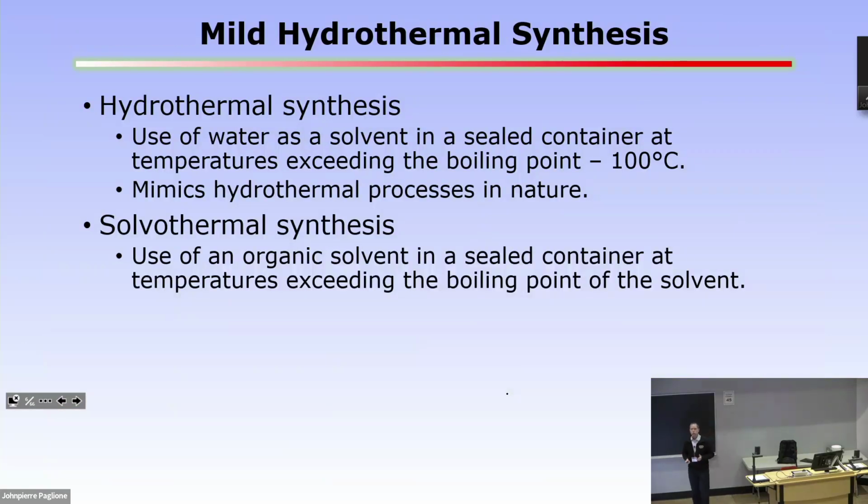So at the most basic level, hydrothermal synthesis is using water as a solvent in a sealed container with temperatures exceeding the boiling point of water, which is 100 degrees C. And the reason people have looked into this historically is it mimics nature. There are a lot of minerals out there in nature, huge quartz crystals that were all grown hydrothermally. Given nature has more time, I mean, they were not grown overnight. In our case, we'd like the reactions to be done in between 1 and 3 days. If you substitute an organic liquid or other solvents, then we call it solvothermal synthesis. And again, you're in a closed container operating above the boiling point of that particular solvent.